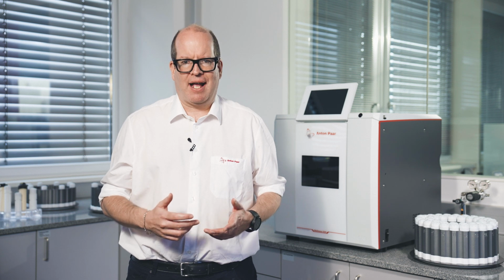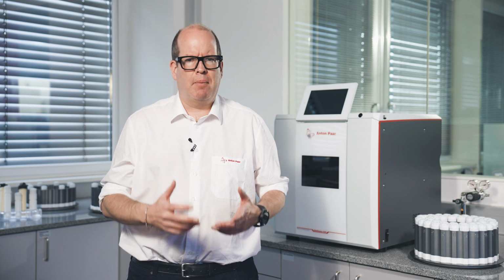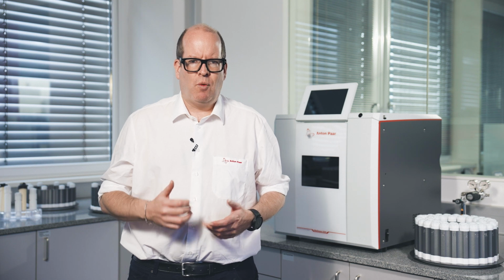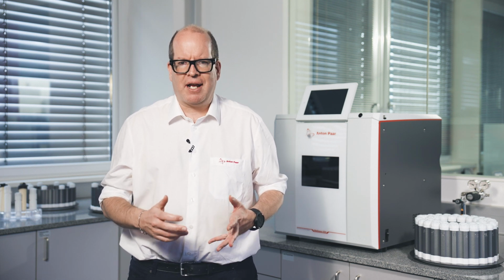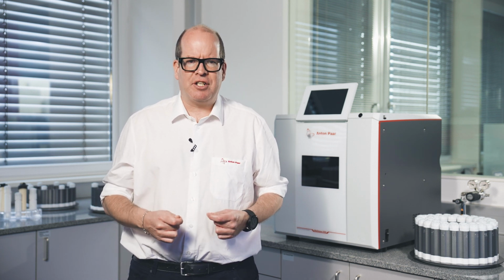dissolution. It should be noted, though, that hydrofluoric acid can be an issue for the AAS instrument, since it causes damage due to its glass corrosive properties. Therefore, if hydrofluoric acid has been used, it must be evaporated before analysis, which is usually quite a cumbersome step. The good news for users of microwave digestion systems is, when using a microwave digestion system, hydrofluoric acid isn't so much of an issue. These systems allow for easy complexation of hydrofluoric acid with boric acid, and consequently, the digestion matrix can be analysed without hydrofluoric acid evaporation.